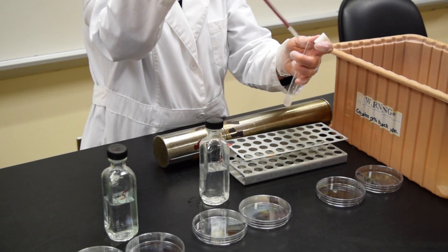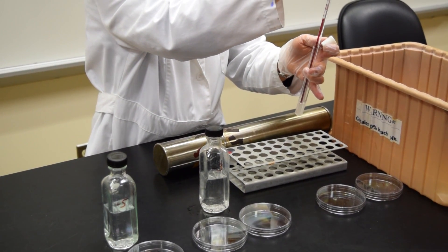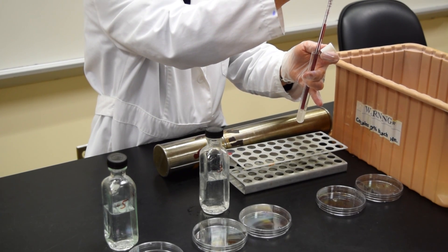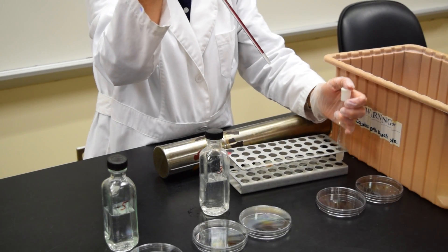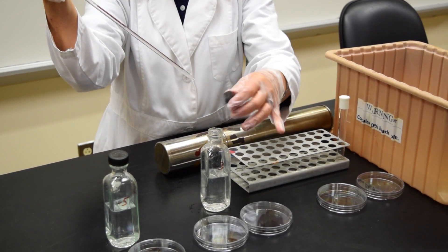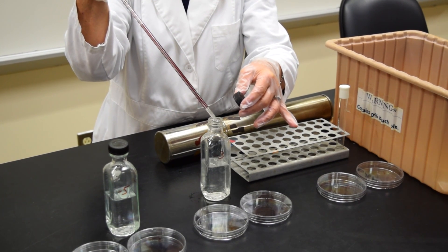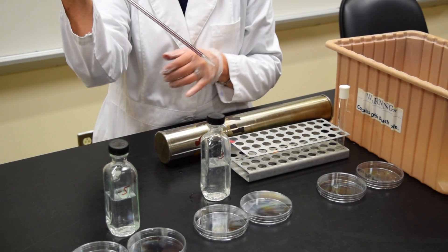Using the same pipette, I'm going to go back into the 10 to the minus 1 tube, draw to 1 ml, and add 1 ml to the minus 3 bottle. I've already uncapped these bottles so it's easy for me to open. Expel 1 ml into the minus 3 bottle.